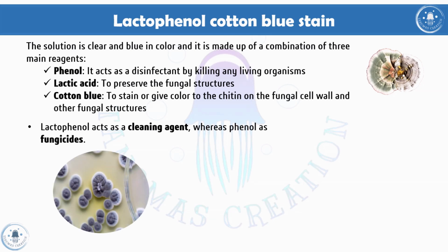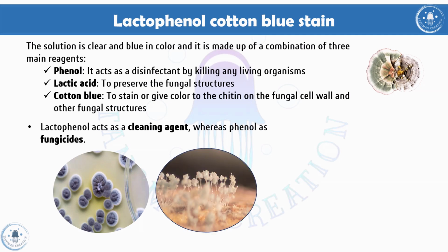Fungi are very commonly grown, you can see them anywhere, and they do not require any particular conditions to grow. Not all fungi are pathogenic or harmful to humans, but some are pathogenic to humans and other animals also, so they come under the notorious types of microorganisms.